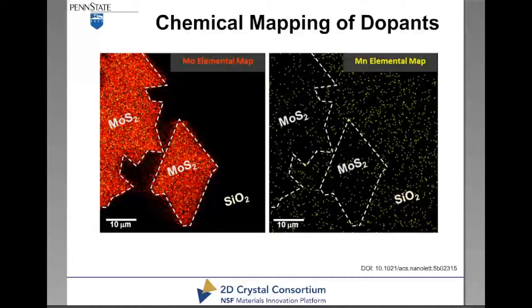So again, STM-STS is a very powerful way for us to understand the electronic properties and understand density of states spatially on the atomic scale. And then on top of it, if you were to go in and look at these individual moiré patterns that are shown here in D, the bright and dark spots, those too can have different electronic states in them. So better understanding that and better understanding the hybridization using these materials characterization techniques can be quite powerful.